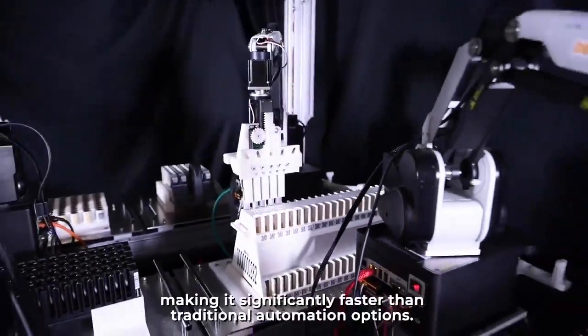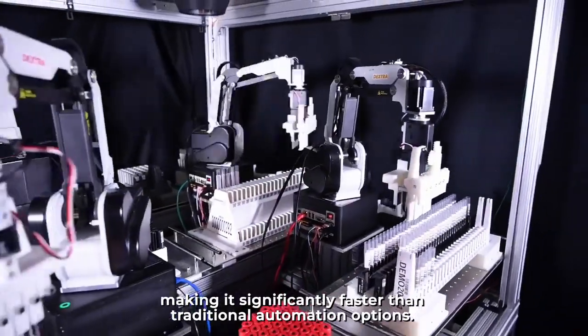The Dextra can handle 20 tubes at once, making it significantly faster than traditional automation options.